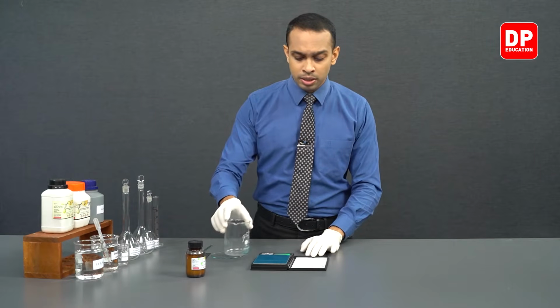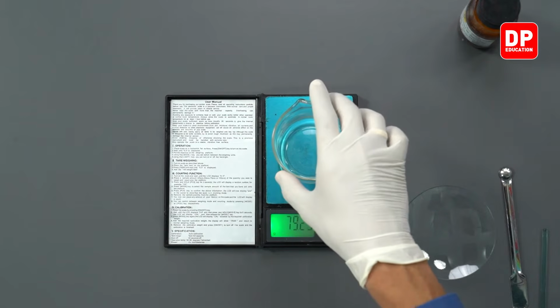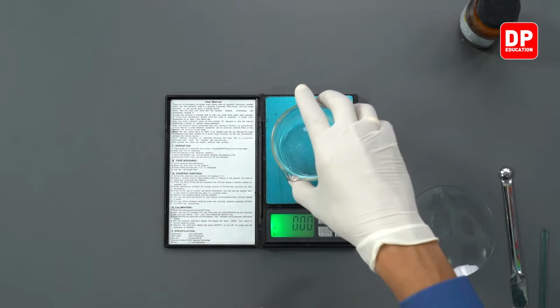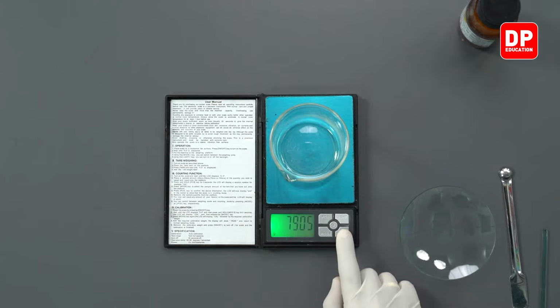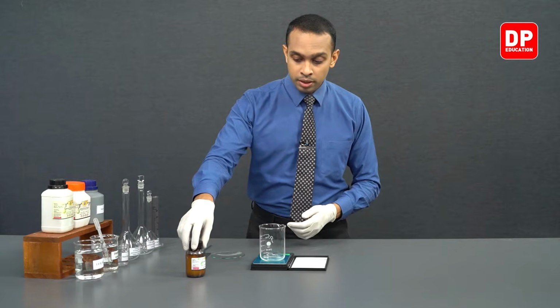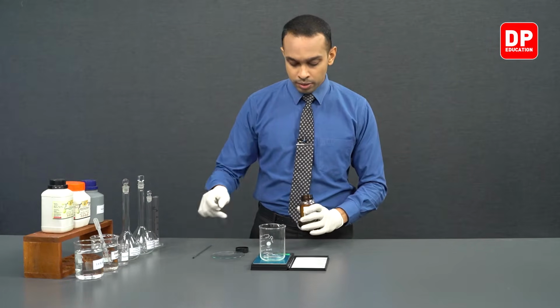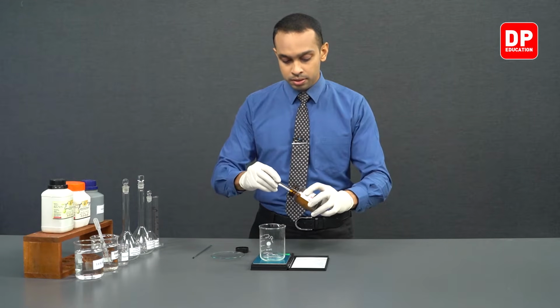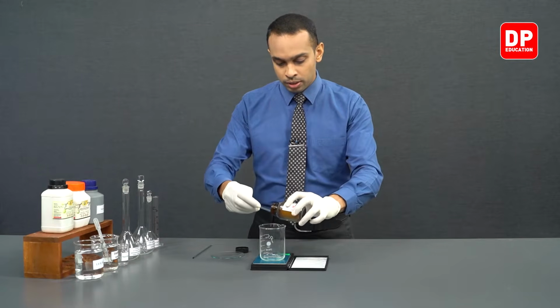The beaker has its own mass, so we use the tare function to cancel that mass out. Now the balance reads 0. Then we can take our potassium iodide solid and measure exactly 49.8 grams.